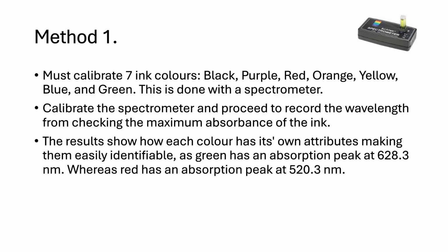And the results can show how each separate color has its own attributes, which makes it identifiable. And going back to the enzyme example, that can show you what color it is changed into or shifted into, and what can happen from that.